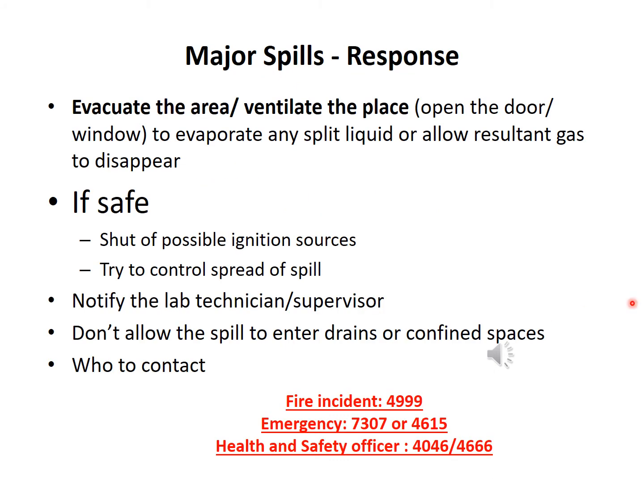Being a student or a worker, you should know the response if a major spill happens. Evacuate the area and ventilate the place, since a lot of chemical has spilled. Open the door, because the air inside the lab is contaminated, and it will be dangerous for breathing if someone is working in the lab or even enters the lab.